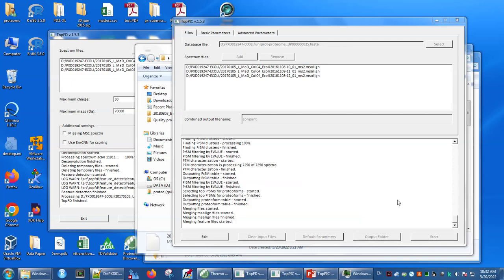So the merging of files, the merging of MS Align files, and the merging of feature files is just how we kick off that process. One of the things that this feature of creating a single conjoint report allows us to do is to assemble a master list of all proteoforms detected in any of the 3 experiments.